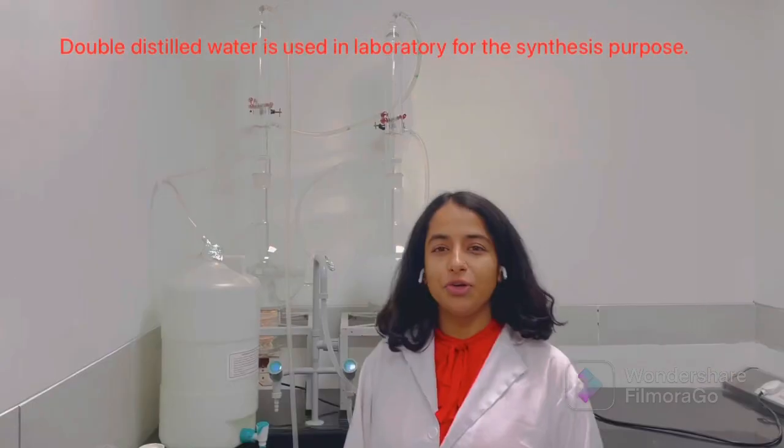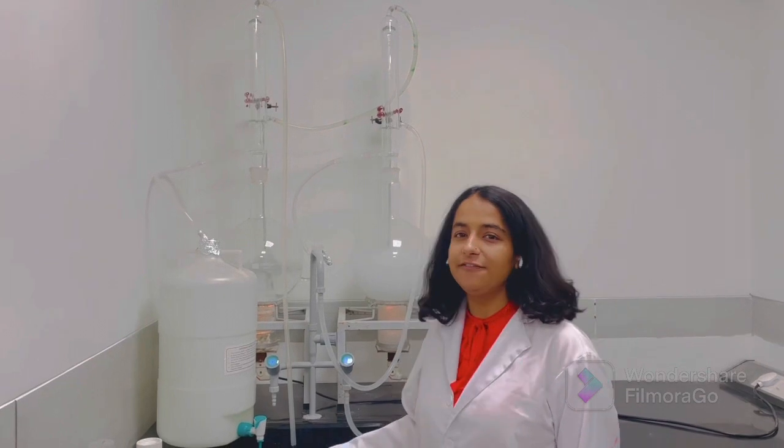Hello everyone, today I will show you how the distillation unit works. Basically, a double distillation unit is used to purify the water twice. I will show you how this distillation unit works.